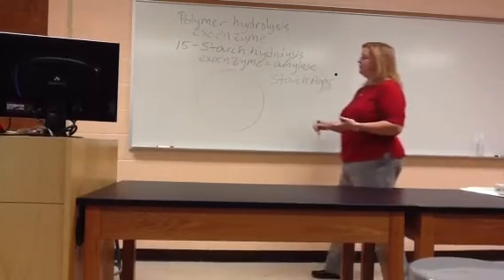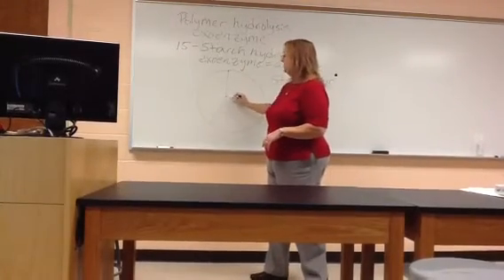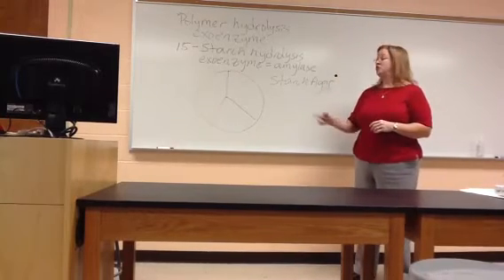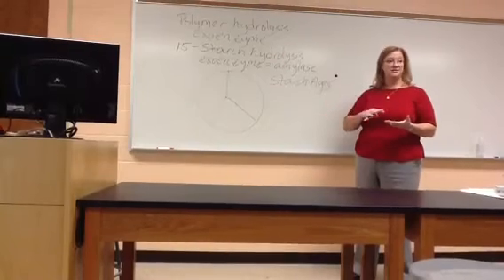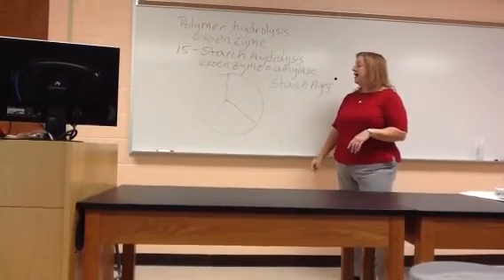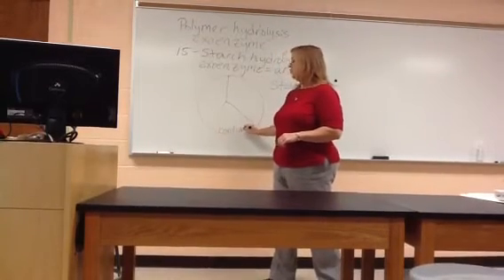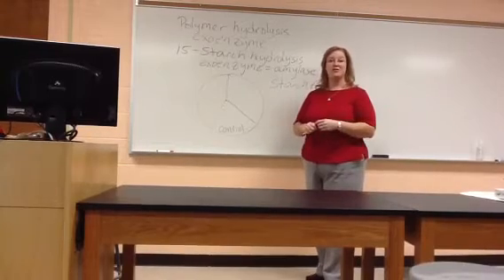What you should do first is get one of those Sharpie markers and divide the plate up into 3 sections. Use sort of the peace sign to give yourself 3 sections. Make sure you're doing this on the agar side. Remember, you never want to label on the lid, the side that has the agar in it. One of those 3 sections is going to be your control, that you don't put any bacteria in. The other 2 sections are for the 2 bacteria that are listed.